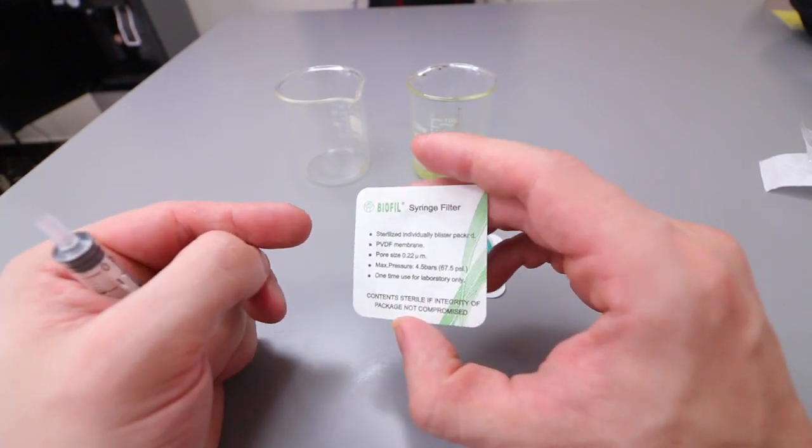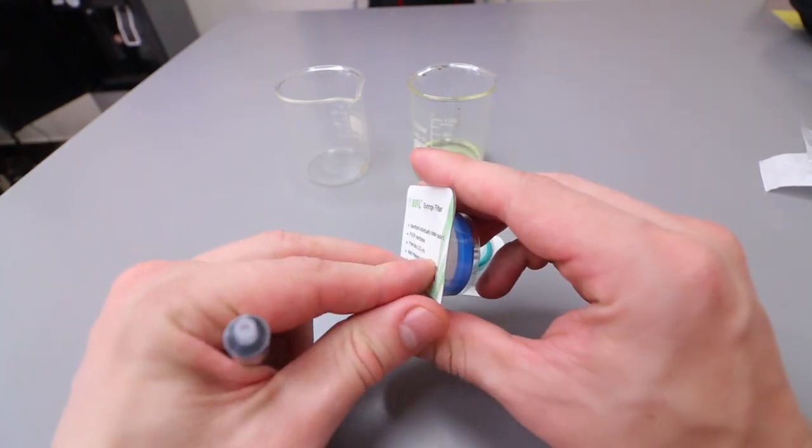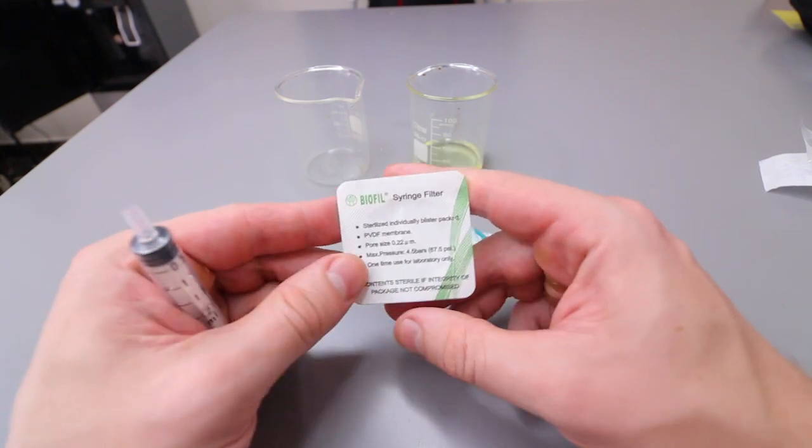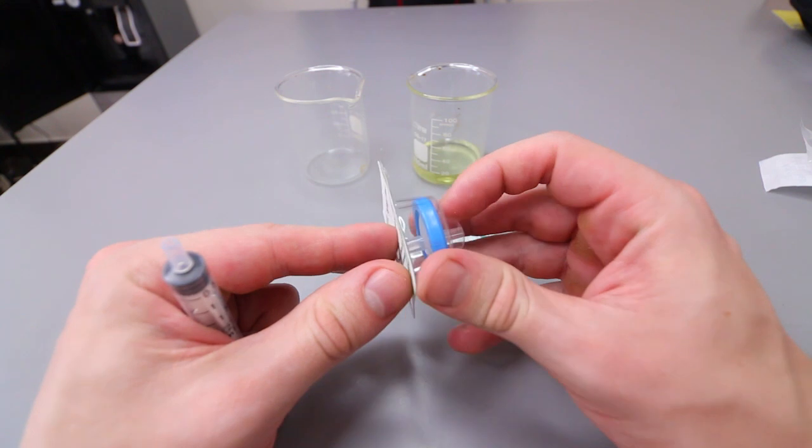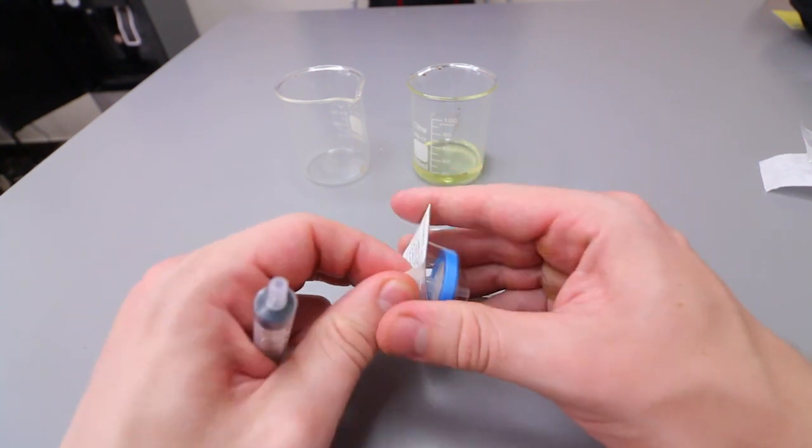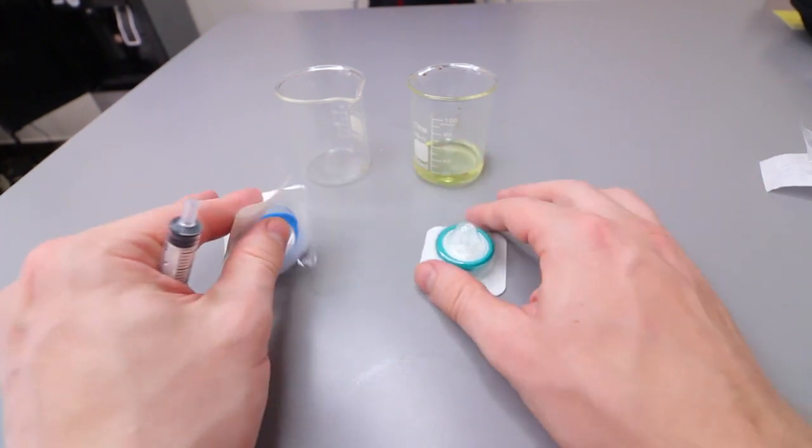You can also use nylon if you want, but also the pore size as well. You want 0.22 just to ensure there's no bacteria that's going to be able to get through. But you also want to be looking at the PSI and I'm going to show you why.